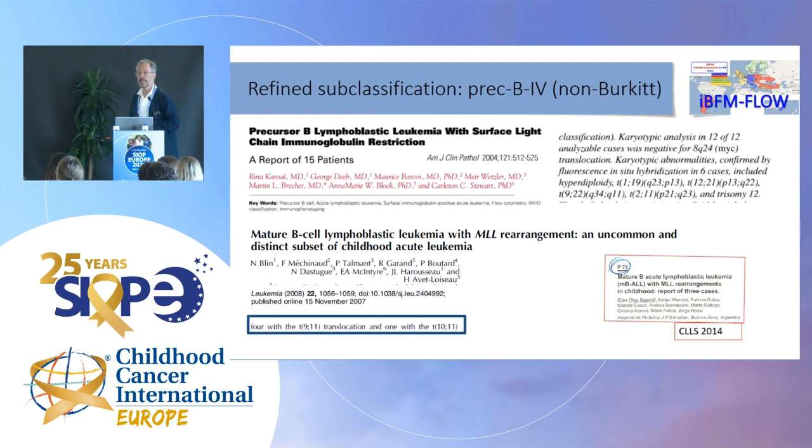So again, it has something to do with maturing, but it's doing something different from regular maturation. So what we are doing is not just boring maturational stage assessment, but we are really building information on what this could be, what type of leukemia, what we should look for.